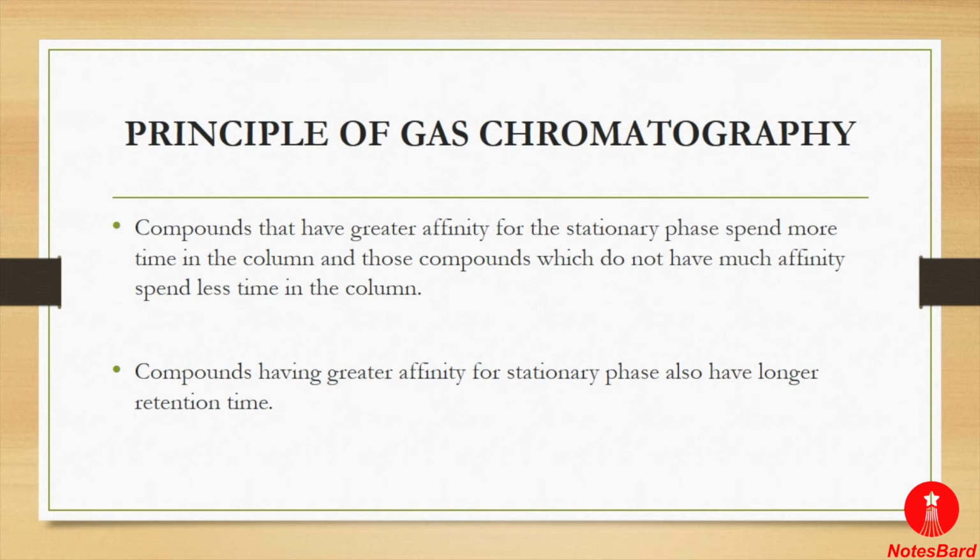These gases carry the analyte through the heated column and separate its individual compounds. In that condition, the compounds which have greater affinity for the stationary phase have a longer retention time, and those compounds which do not have greater affinity for the stationary phase do not have a longer retention time.